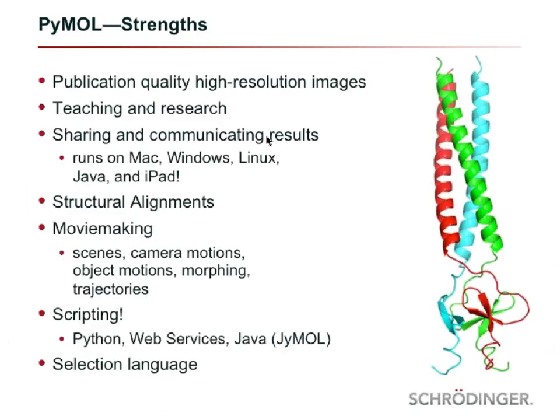Okay, so what are the strengths of PyMOL? Why do people use it? Of course, high publication quality figures, like the ones that you saw on the journal covers, but also for presentations and PowerPoint slides.